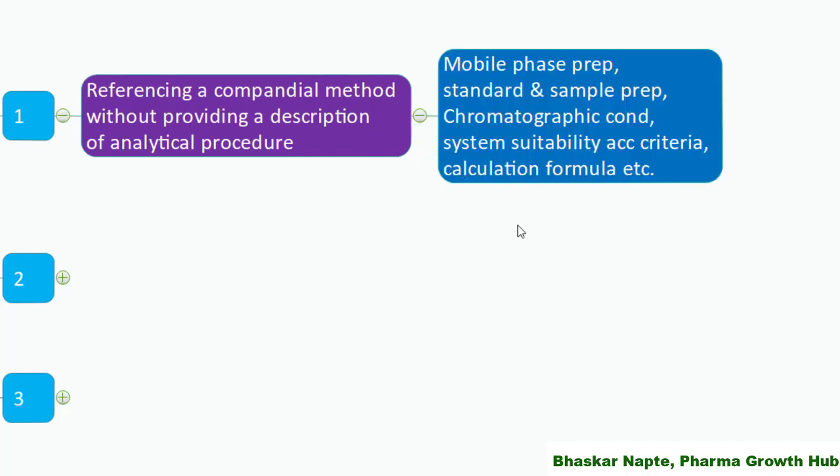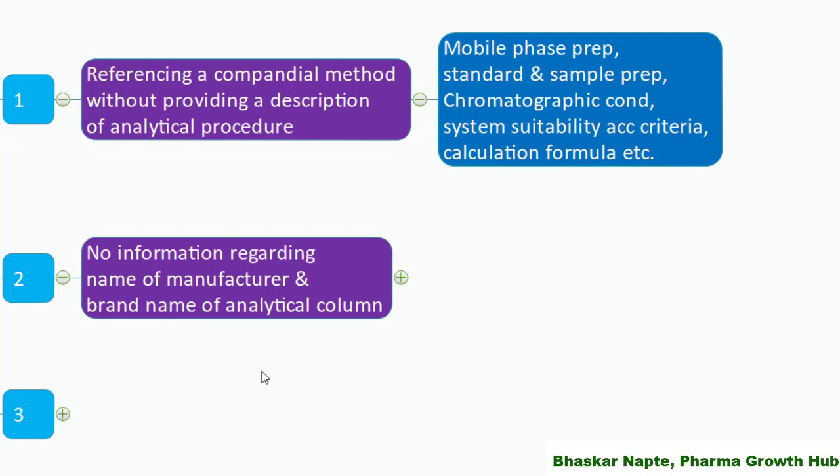Mobile phase preparation, standard and sample preparation, chromatographic conditions, acceptance criteria for system suitability, calculation details, and reference blank, standard, and sample chromatograms are very critical information. This information must be included in the method of analysis. Just giving a reference to a compendium is not a good idea.